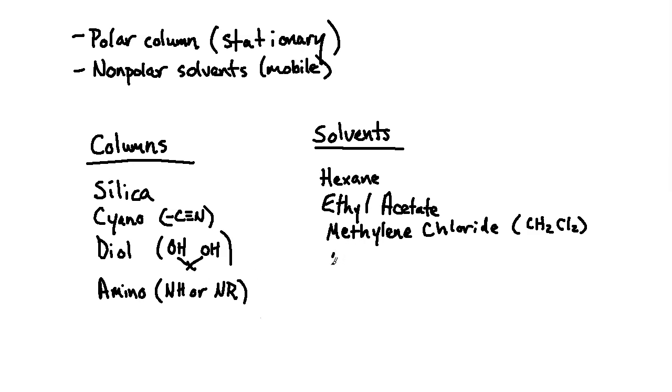Okay, some of your other ones, now you have to start being a little more careful and selective when you're picking these out because we're starting to get more and more polar. Ethers and acetonitrile. Now, if you remember, and you go back to the lecture on the reverse phase, acetonitrile and ethers were actually at the bottom of that solvent list. And that solvent list was the reverse of this. So it said, okay, water is one of the go-tos, and that's usually your primary one. And then you have your alcohols, methanol, ethanol, things like that, right? Then you have acetonitrile, and then you have ethers. And ethers were kind of like, okay, this is middle of the road polarity. And that's generally where we stopped in that reverse phase lecture.